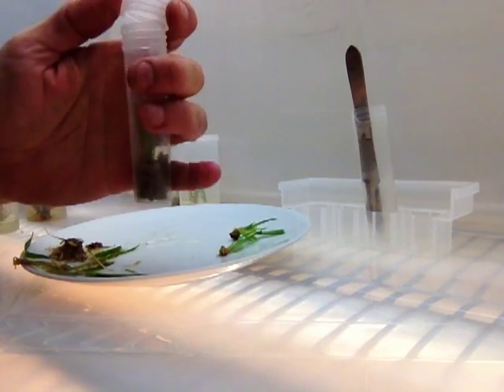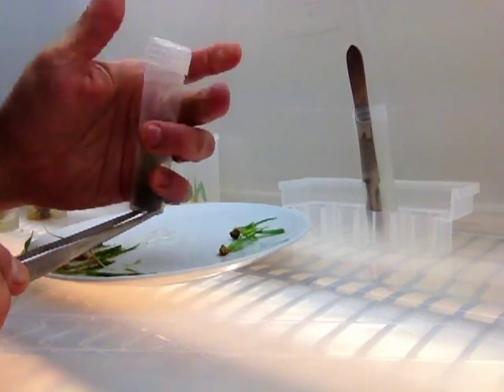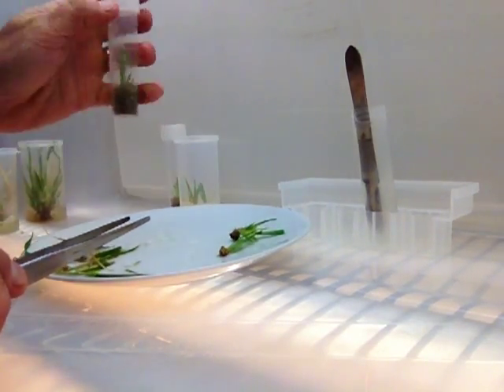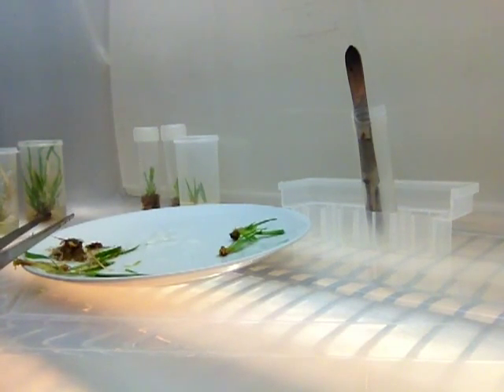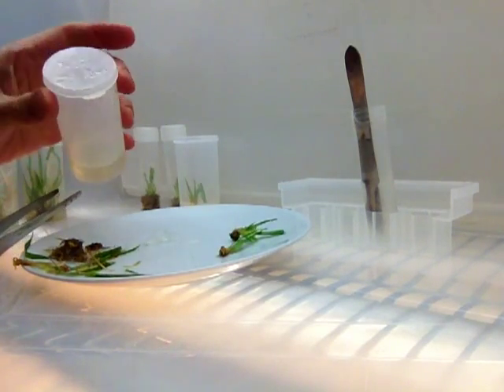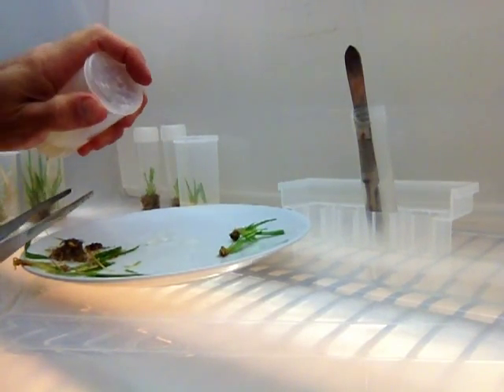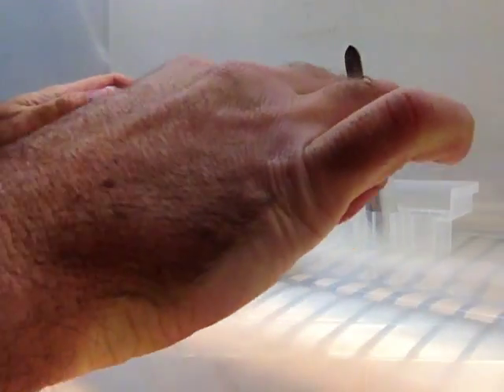Right down in there. Screw that lid down. Let's do one more of those. Here I'm tilting out the little bit of condensation — it's clean so I spill it on the plate.